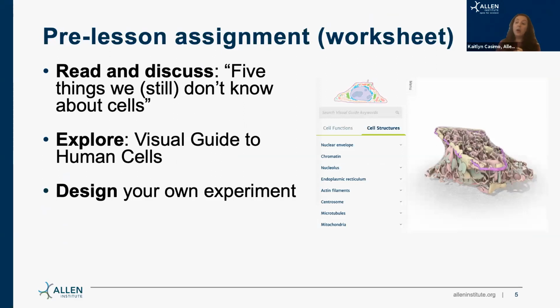All right, so if you're following along with the lesson plan, the worksheets begin on page 11. The packet up to that point includes some background information that is really helpful for you, the educator. So this is what the students are going to see.